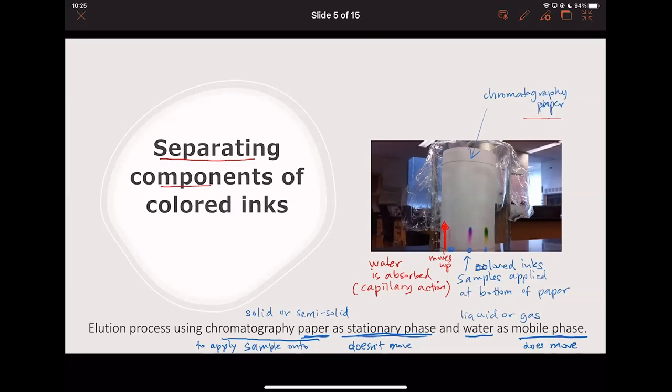Okay. So what I just gave you is an example of the stationary phase. The stationary phase is that room. The samples are in that room. The people are in that room and they're stuck there. But then the mobile phase is something that makes that stuff move. What's a mobile phase? That was me. I'm the person who jumps in, grabs someone and says, let's go. The difference is only one person went with me. So separating out the 5 people, they're not all going to decide to go with me. Not all components. Some components are going to be more attracted to the mobile phase.